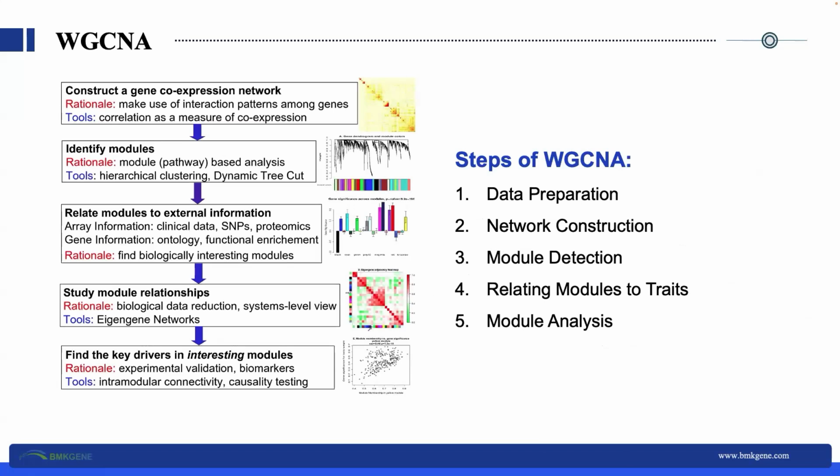For most of us, we only need to know that WGCNA helps us find many genes related to few genes, and find few genes related to many genes. Next, I will demonstrate how to submit WGCNA using BMKCloud and go through the main results.